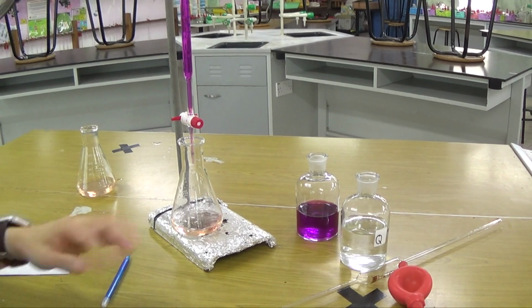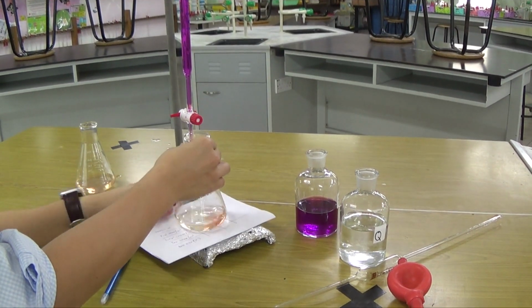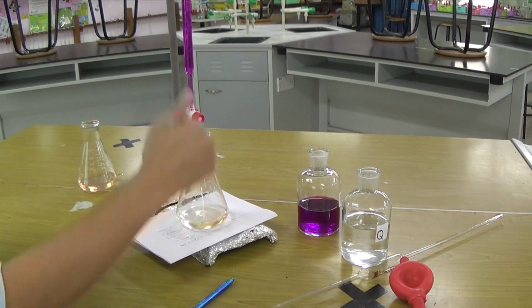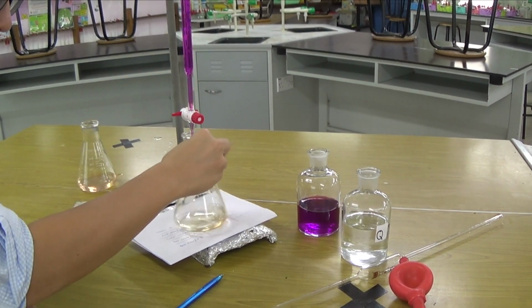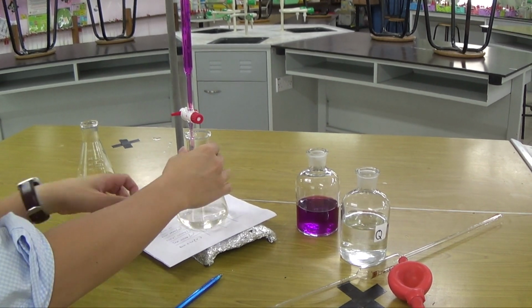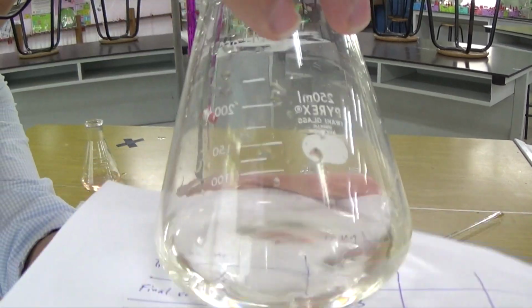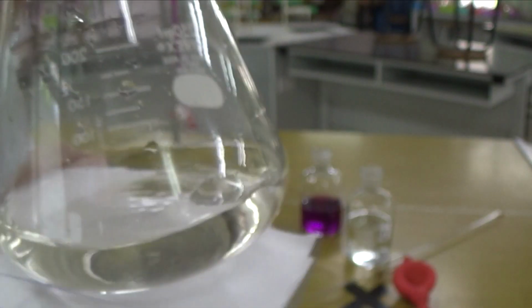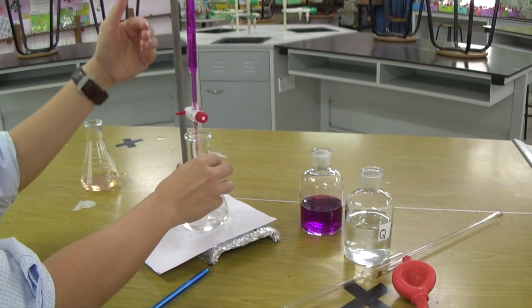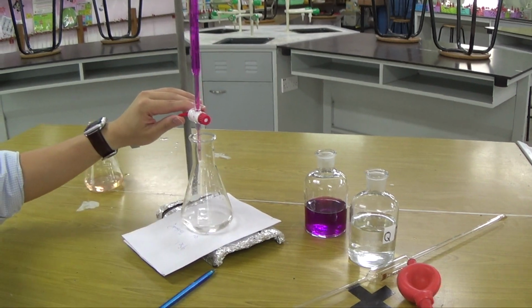You see this thing is a bit kind of colored now, but then we know this is still iron 2+ in excess because the KMnO4 is still not in excess. If I swirl it, as you could see, it goes back to this color, which is not colored at all. Okay, so it's slightly darker now because of the iron 3+ being formed in solution, but you don't have excess KMnO4 yet. Your end point is when you have a permanent pale pink, because one extra drop from here will not go away. One extra drop from here will remain there. You get a permanent pale pink color.